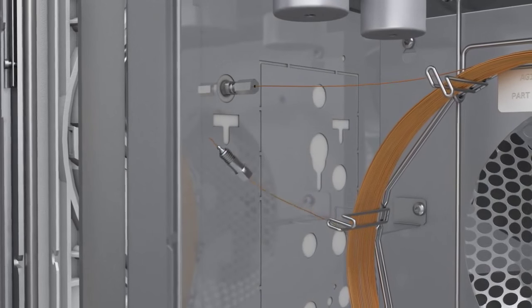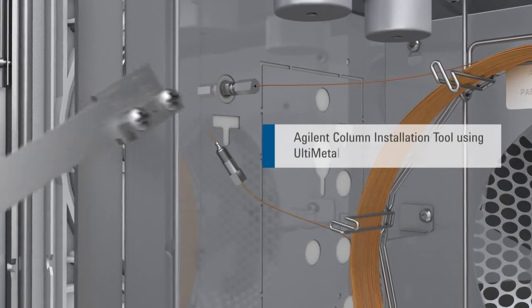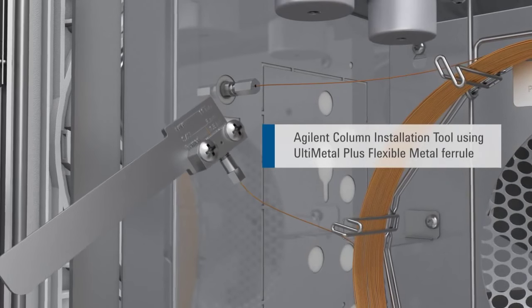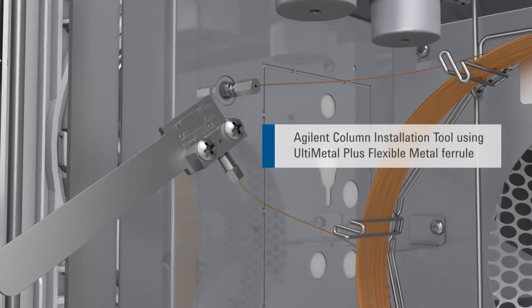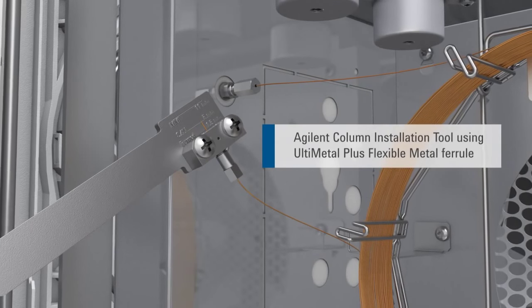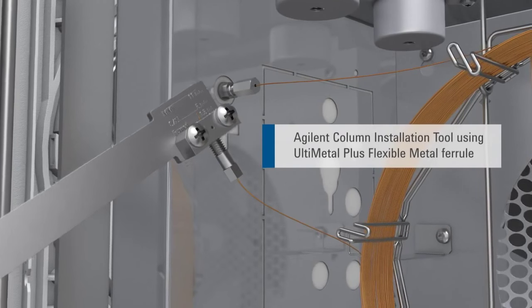To pre-swage the flexible metal ferrule onto the column, use the column installation tool to measure the required length. Tightening the column nut permanently fixes the flexible metal ferrule onto the column tubing.